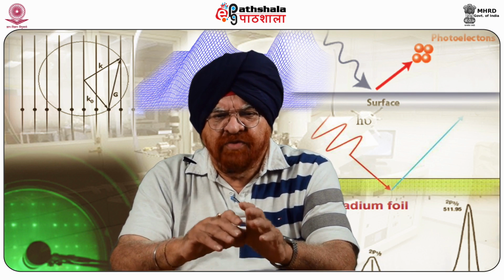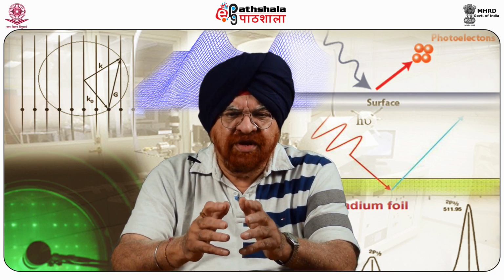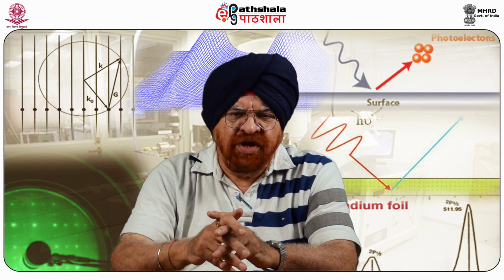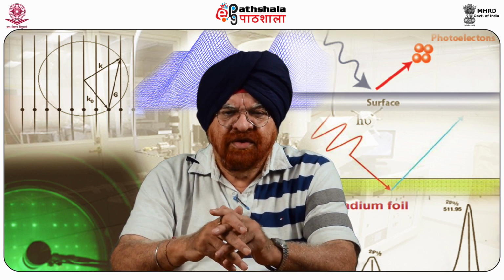In 1967, Siegbahn published a comprehensive study of XPS, bringing instant recognition of the utility of XPS. Siegbahn received the Nobel Prize for Physics in 1981 to acknowledge his extensive effort in developing XPS into a useful analytical tool, to be precise, a useful surface analytical tool.